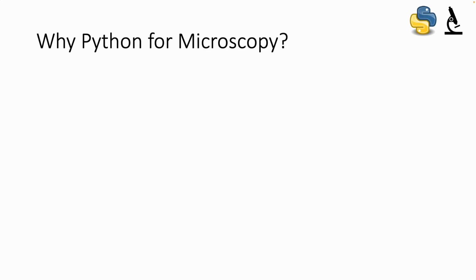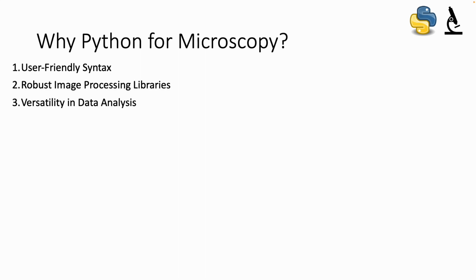Why is Python for microscopy so useful? I can name a lot of reasons. It is very user-friendly in its syntax, especially for beginners. It has robust image processing libraries, a lot of packages that you can use for image processing of microscopy data. It is very versatile in data analysis. Again, it comes with a lot of packages and libraries you can use.